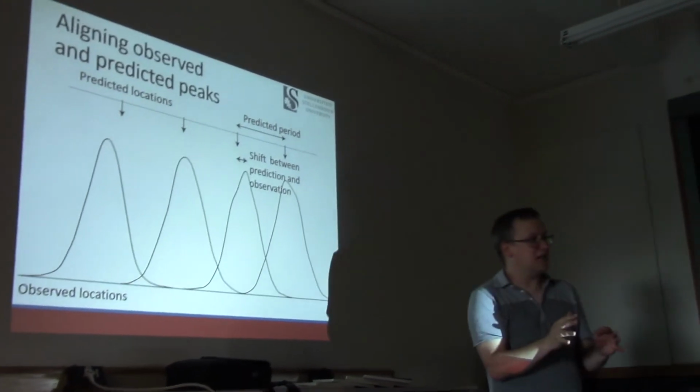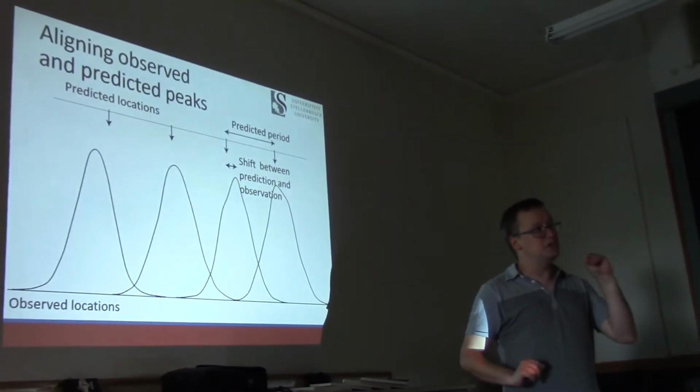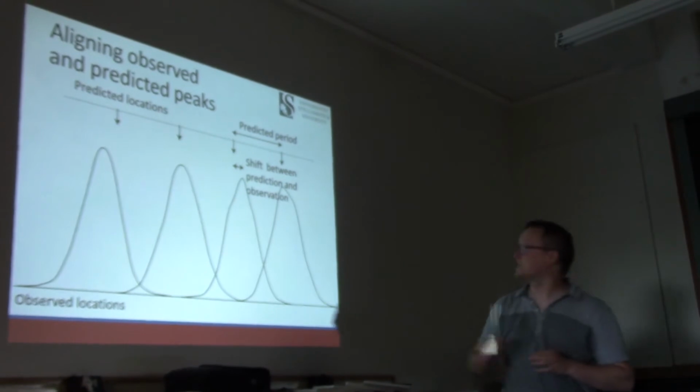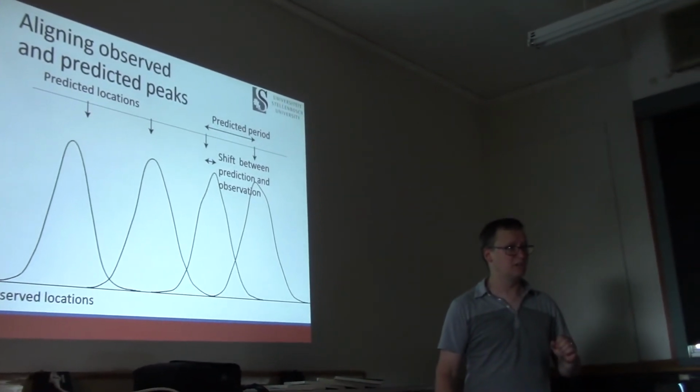And in this case, we want to punish those nucleotides. We're going to say those nucleotides are a little misshapen. They're a little earlier or a little later than we expected them to be. As a result, we have a higher error probability associated with it.